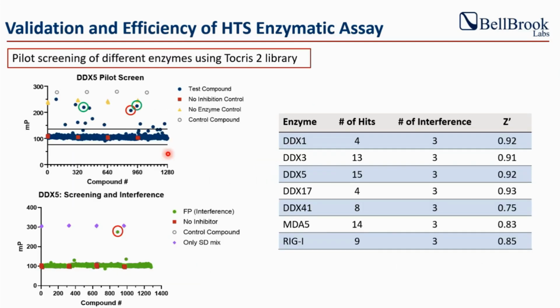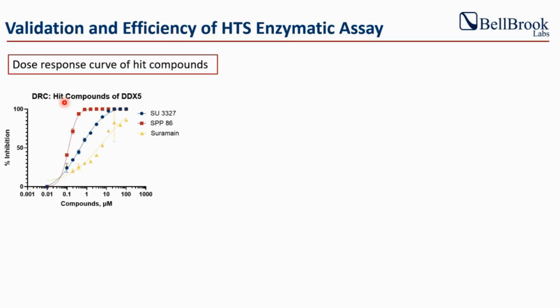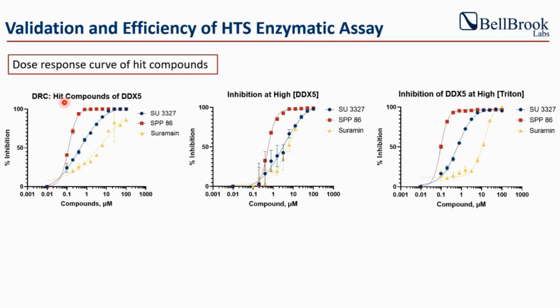Primarily, as I showed, this is the interference assay. From here, if you compare this interference, definitely we exclude this interference. Also, another one we found among these RNA, we found one universal promiscuous compound. We think it's promiscuous because it was showing SCH202676. It seems to be promiscuous, and the hill slope is very high for that compound. So by doing all these, you can get an idea whether it's a false positive, aggregator, or promiscuous or not.